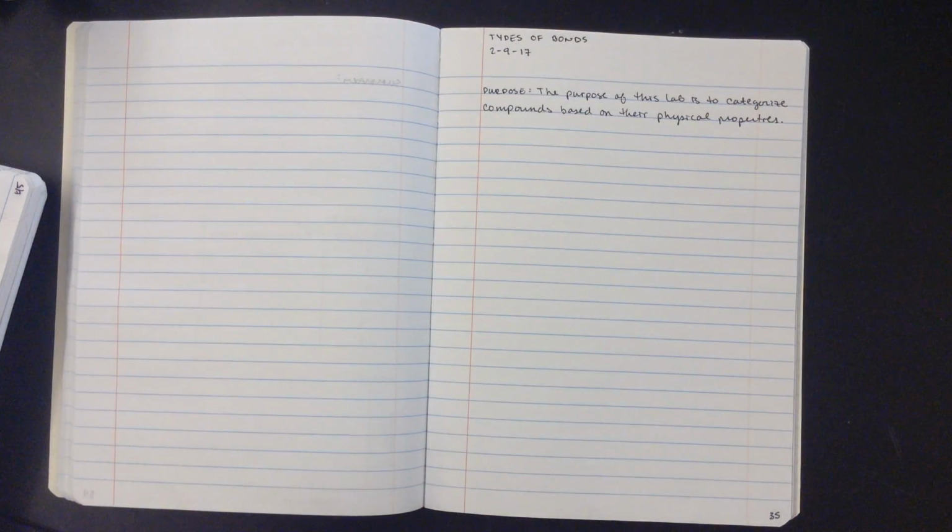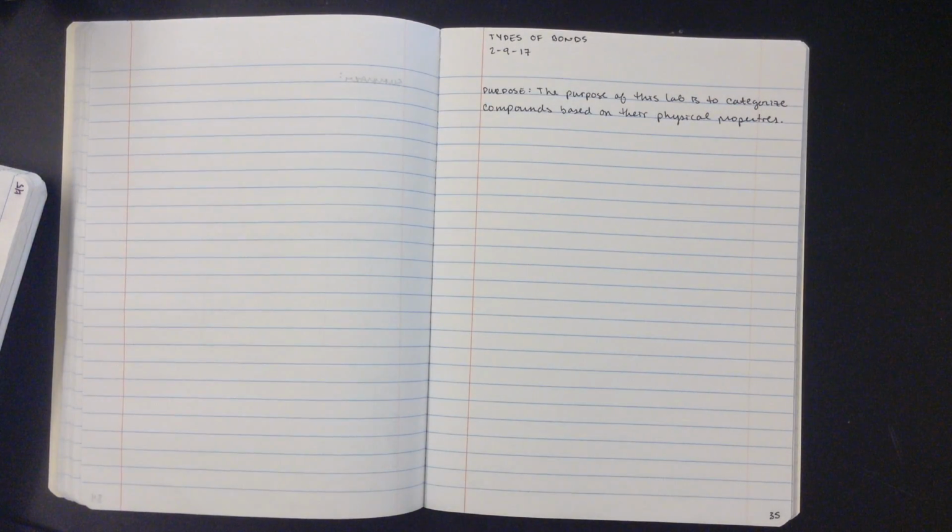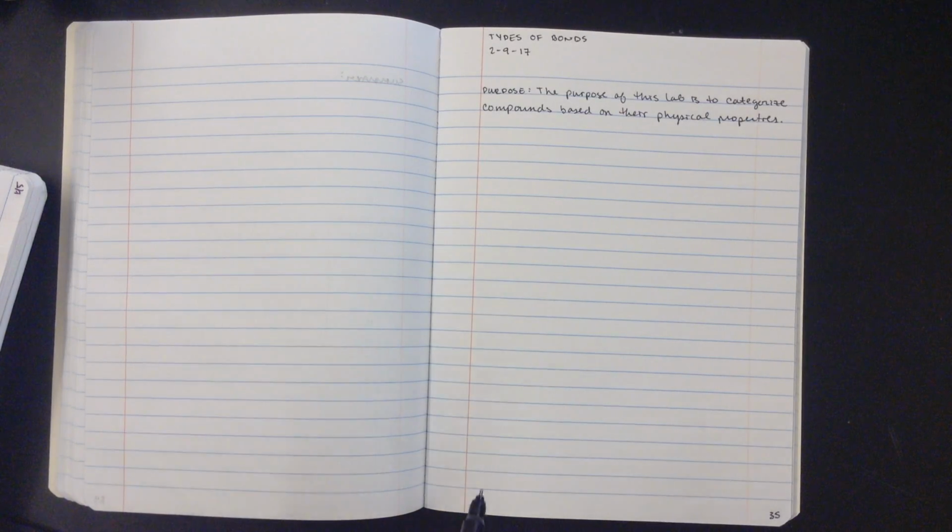So what this means is we're going to have a set of compounds that we're going to run a couple of tests on, and then we're going to use the results of those tests of their physical properties to categorize them based on similar properties. So for our hypothesis, we're going to predict which ones we think are going to be similar.